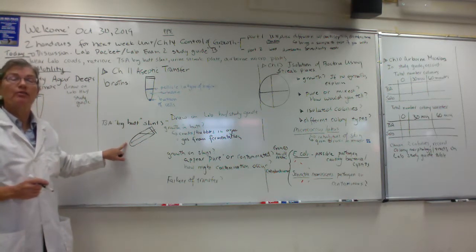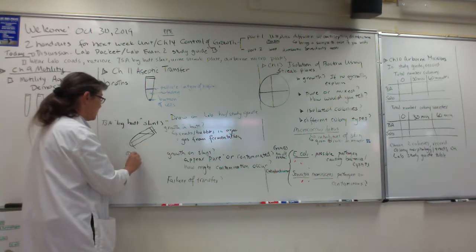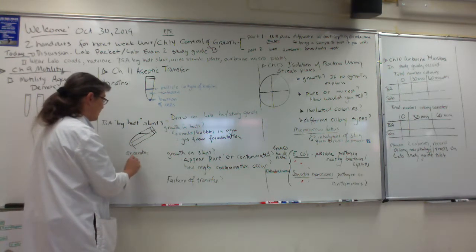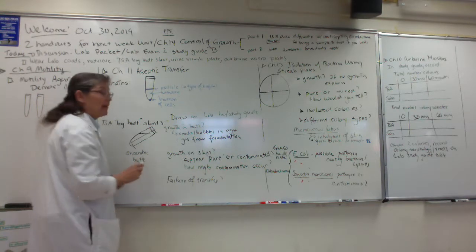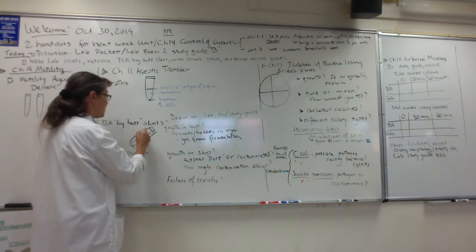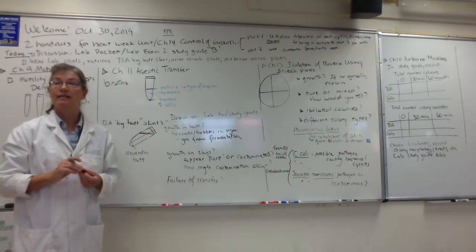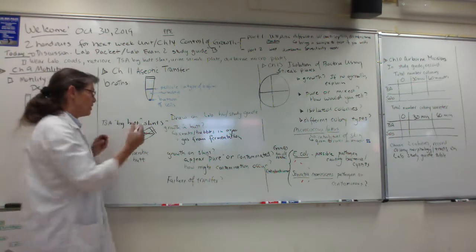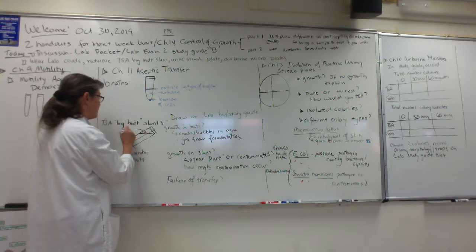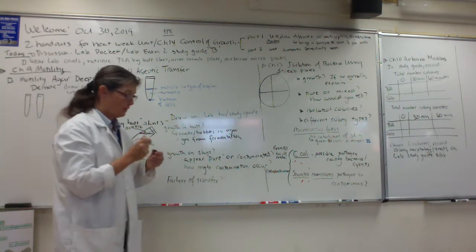Good, that's right. You're testing to see if your microbe can grow anaerobically, so the butt is going to be anaerobic. And then what did you do after you stabbed the butt? You streak the surface. And why did you stab and streak? Why did you streak the surface of the slant? Perfect, you guys, to see if your microbe can grow aerobically. Okay, good. All right, folks, so let's just walk through some of these questions.